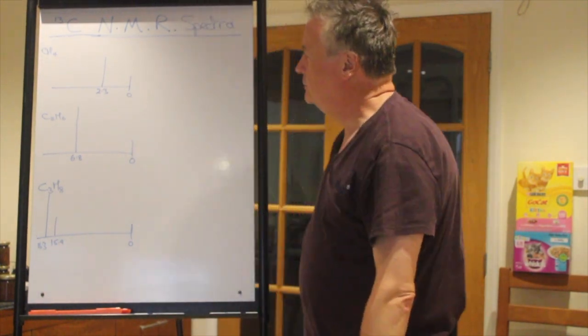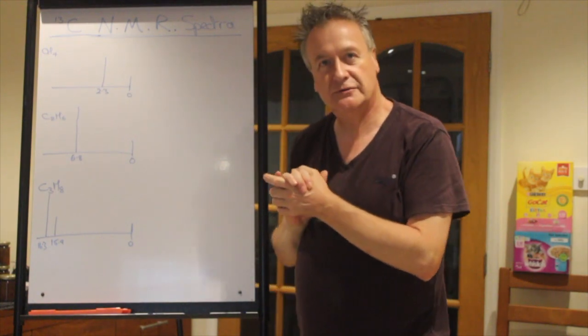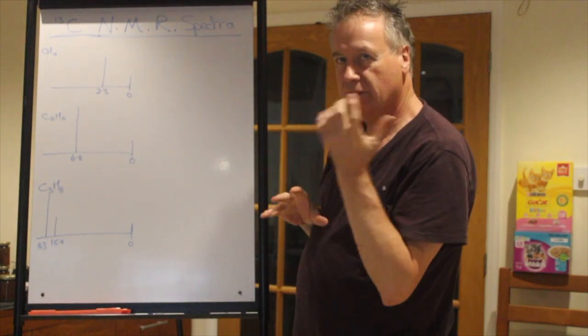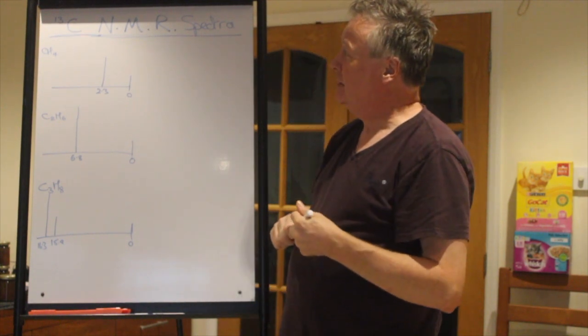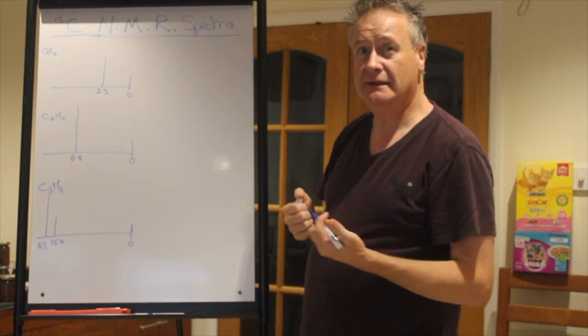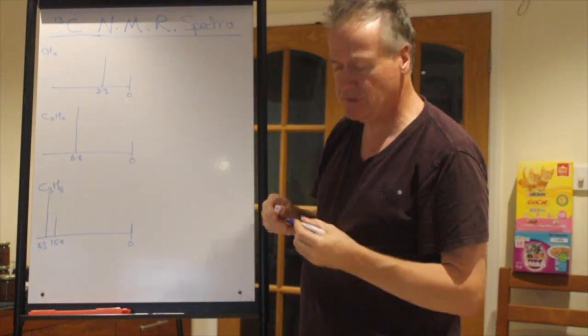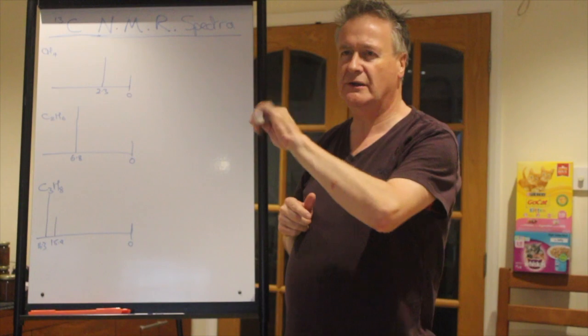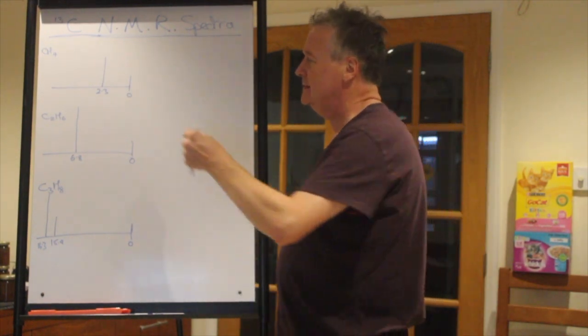There we go. So what would the NMR spectra for some of those things we've just looked at the environments of look like? Well, here's the first 3. Methane, single environment. This is the chemical shift value. Now in an actual question, it's likely you'll have to read it off the scale rather than be told the exact value.